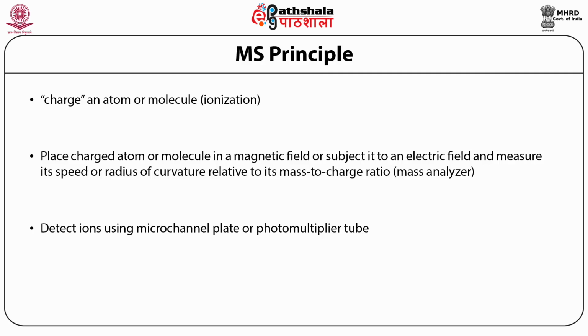A mass spectrometer generates multiple ions from a single sample. Ionic forms of sample molecules are advantageous, as ions are easier to manipulate than neutral molecules. These molecular ions undergo further fragmentation. These ions are separated according to mass-to-charge ratio, that is m/z, in the analyzer region.